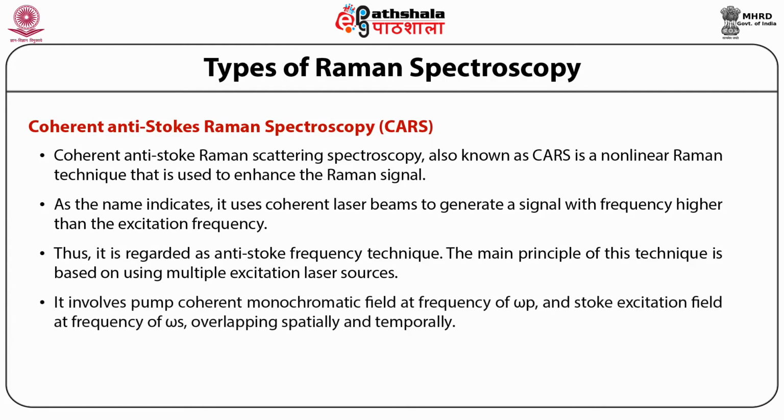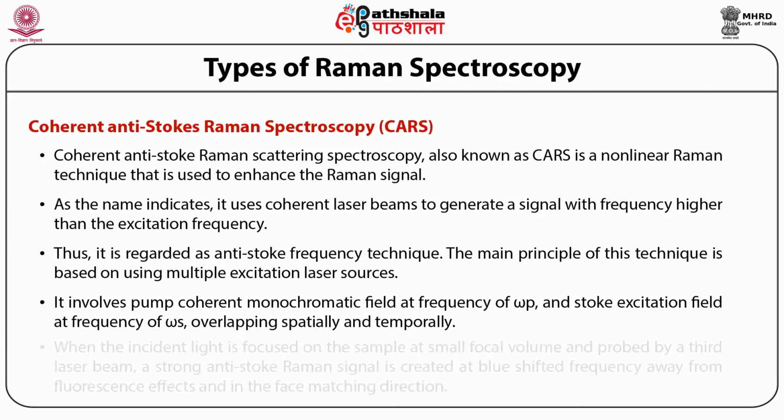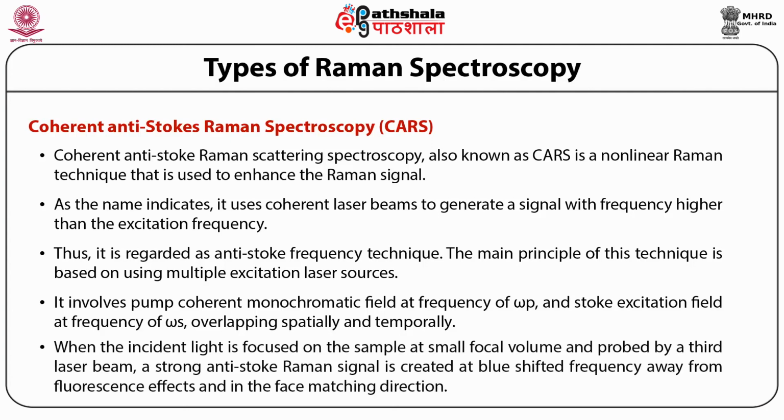It involves a pump coherent monochromatic field at frequency omega p and a Stokes excitation field at frequency omega s, overlapping spatially and temporally.